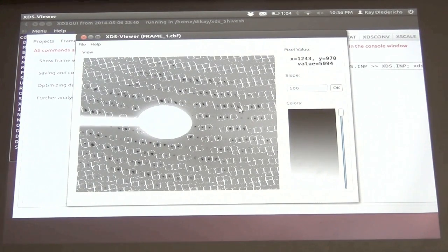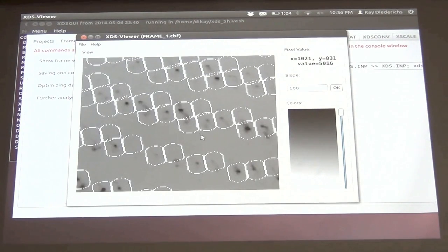This doesn't look good to me, but overall, it may or may not be right. Oh, okay, up here this looks pretty terrible. So I think this crystal is really wacky and it's questionable whether a lot can be squeezed out of this.